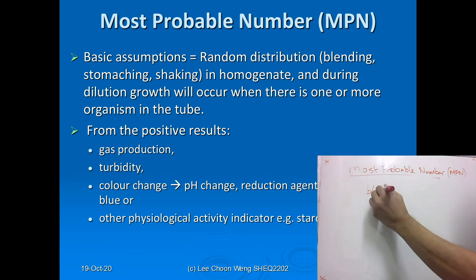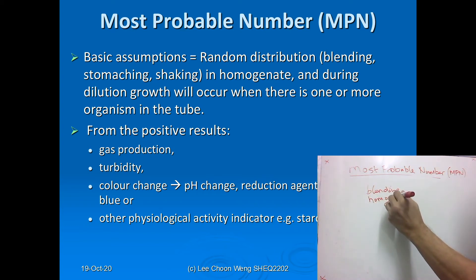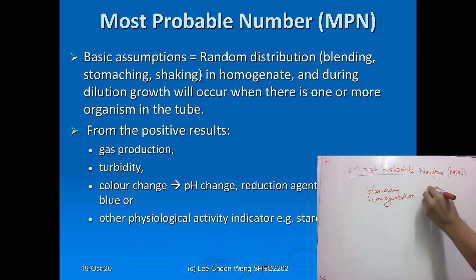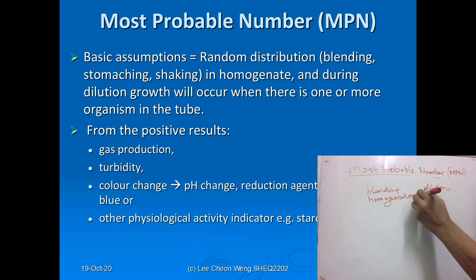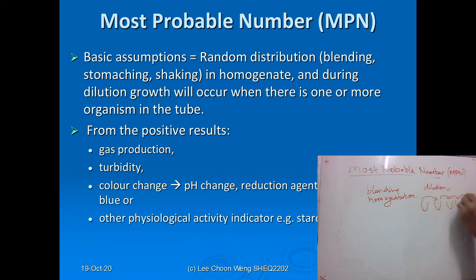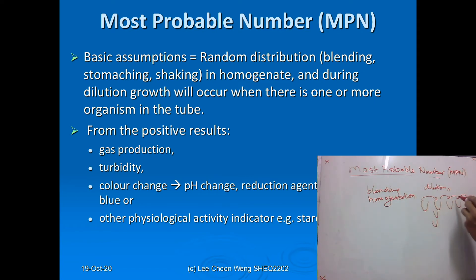Blending and homogenization are very important. If homogenization and dilution are not carried out properly, the results obtained when you inoculate into your MPN tubes will not be accurate.